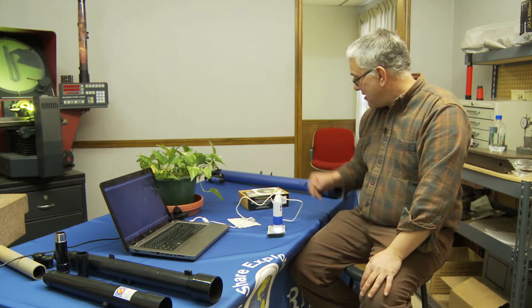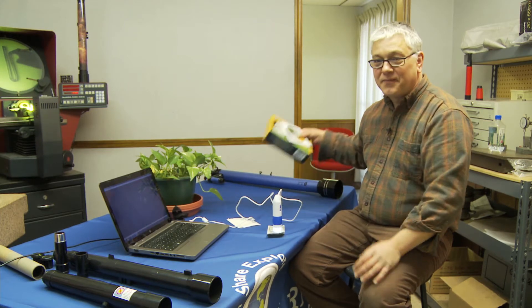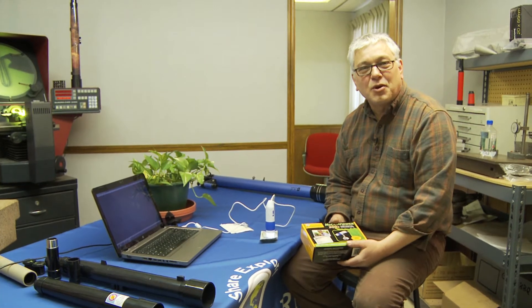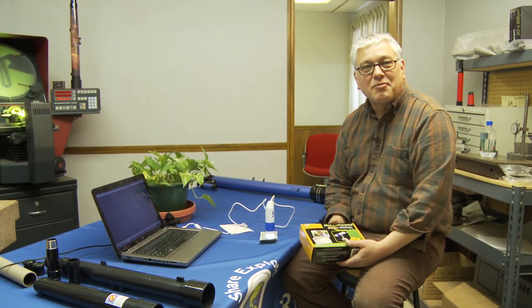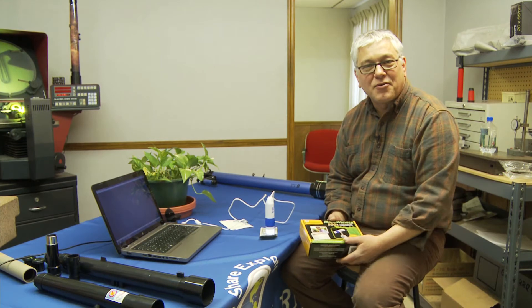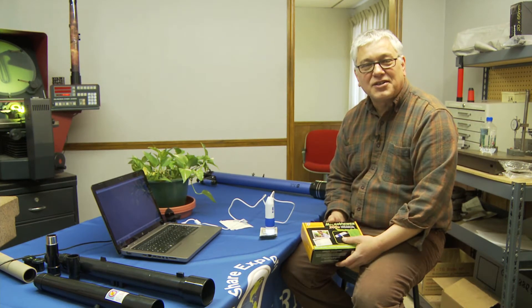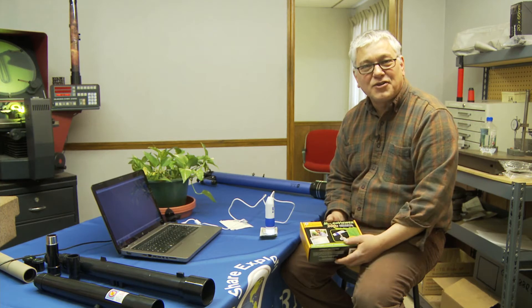I'm talking about the Microbewer 200. It's a digital microscope. It's kind of the next evolution of microscopes. It's not the microscope that we're used to where we go into the lab and we look through and we have a couple of lenses and we see just a small section of things and it's very hard to adjust.